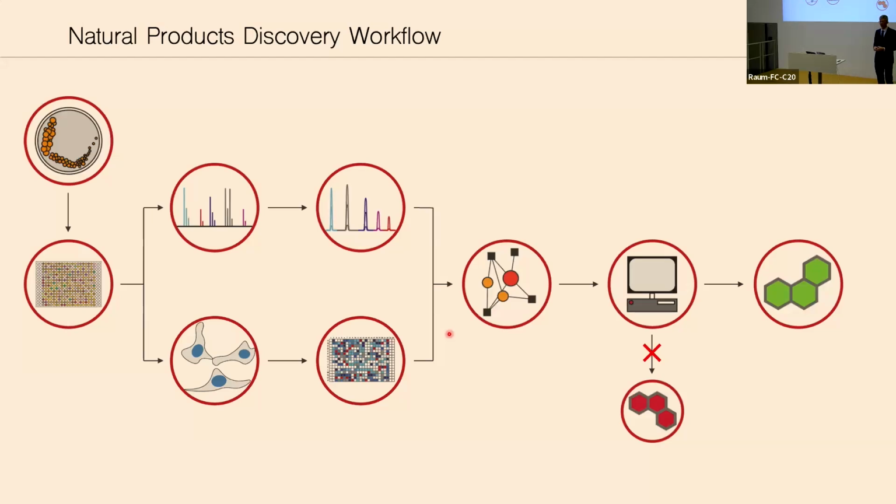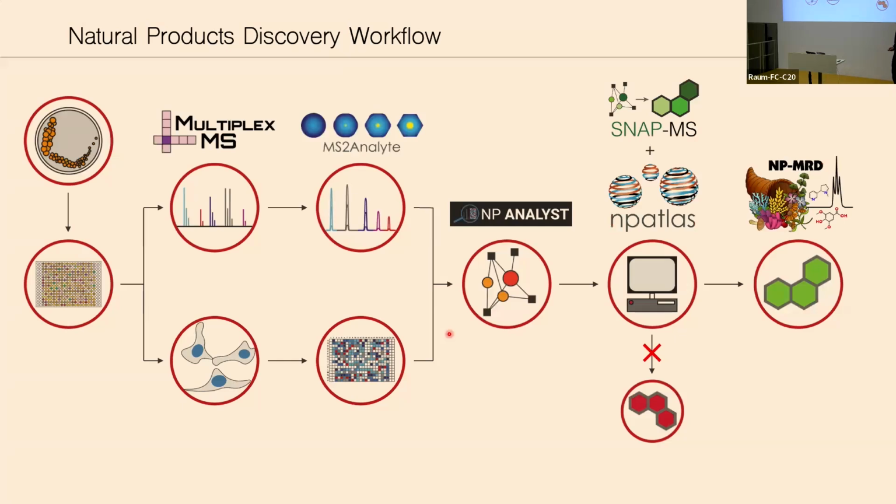And as soon as you start doing that, then you start needing informatics, because those data sets become big very quickly. They become really hard to handle and very difficult to interrogate. And that led us to start working in the area of informatic tool development. So in the last 5 years, we built a number of open source tools which aim to address bottlenecks in various places in this discovery pipeline.